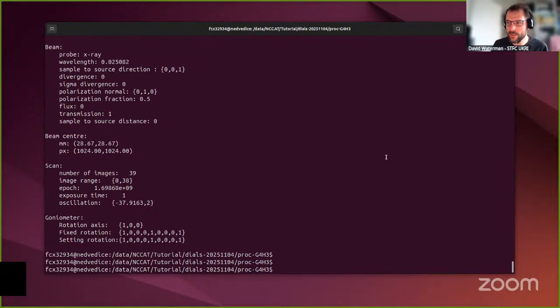So what we're going to do is I need to set an environment variable. And I just need to remind myself exactly what the name of the variable is. The reason that this is not easy is because we're dealing with the horrible world of nasty formats and conversions, and that's why it's not entirely straightforward to import this type of data.